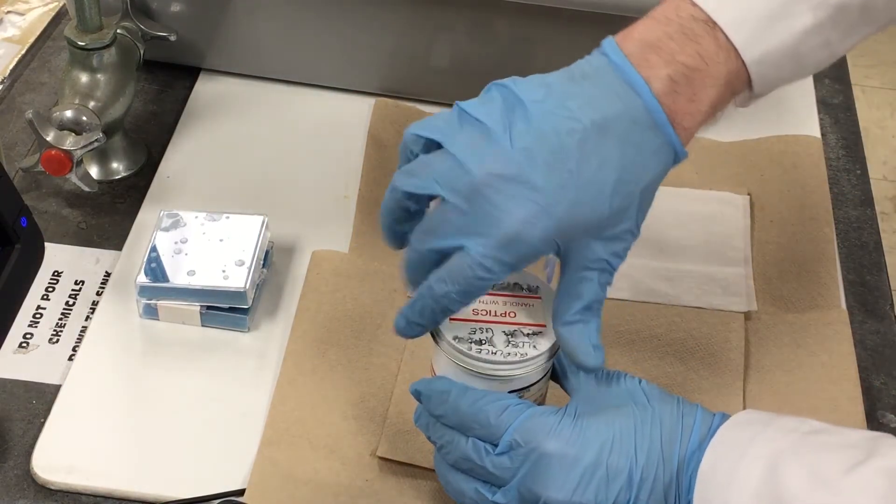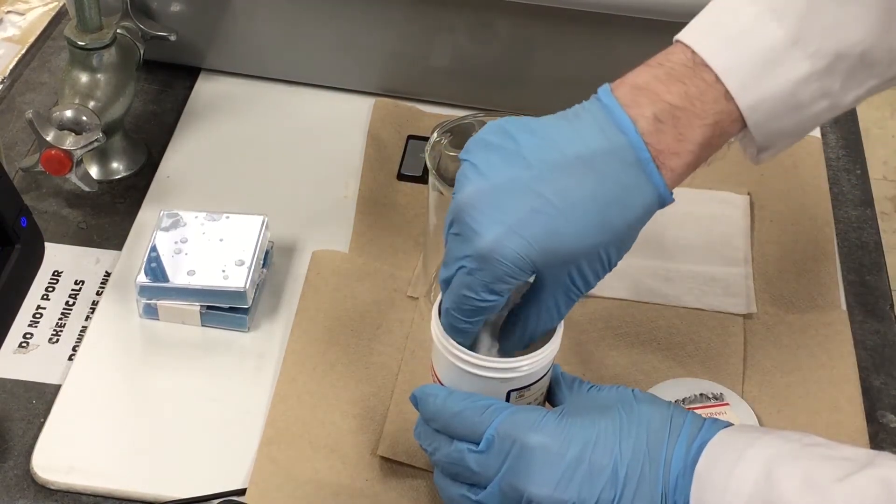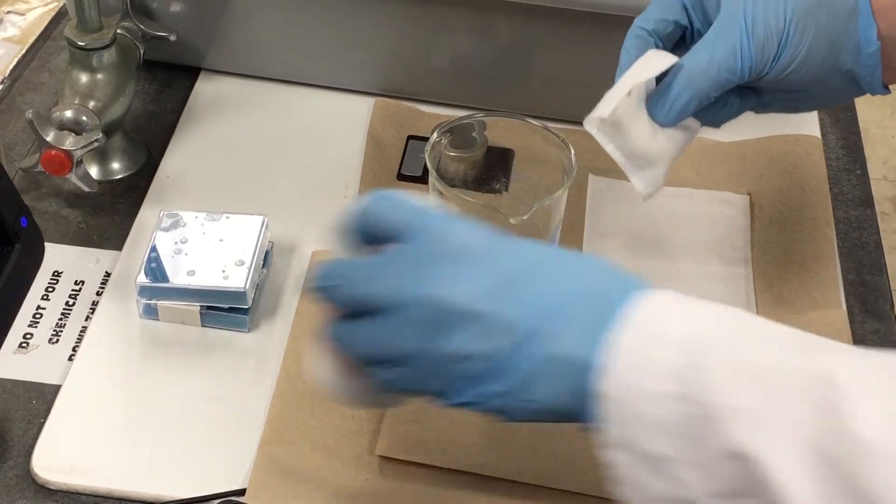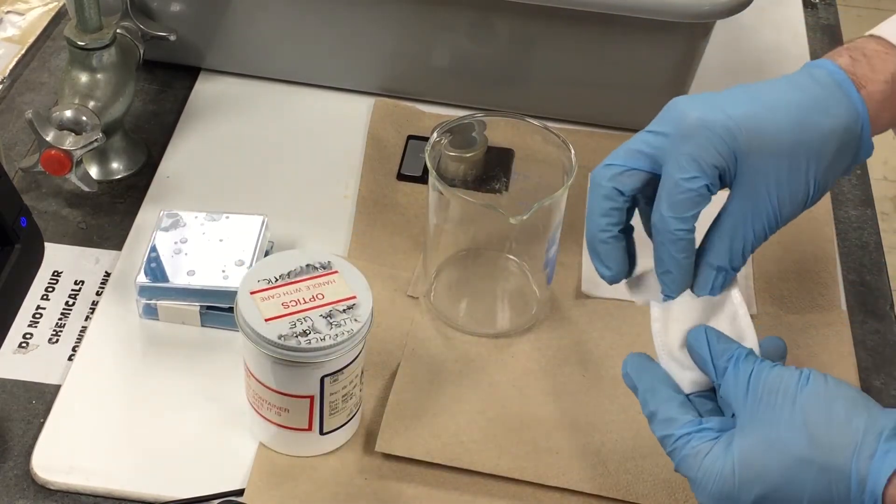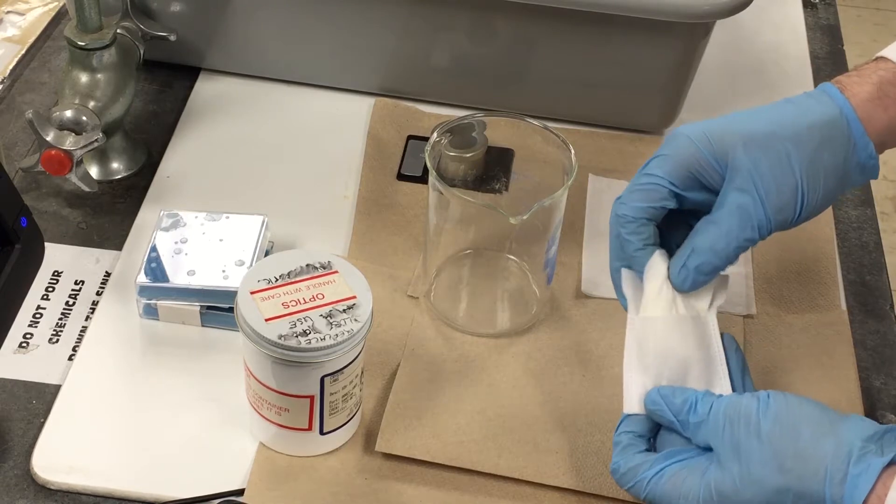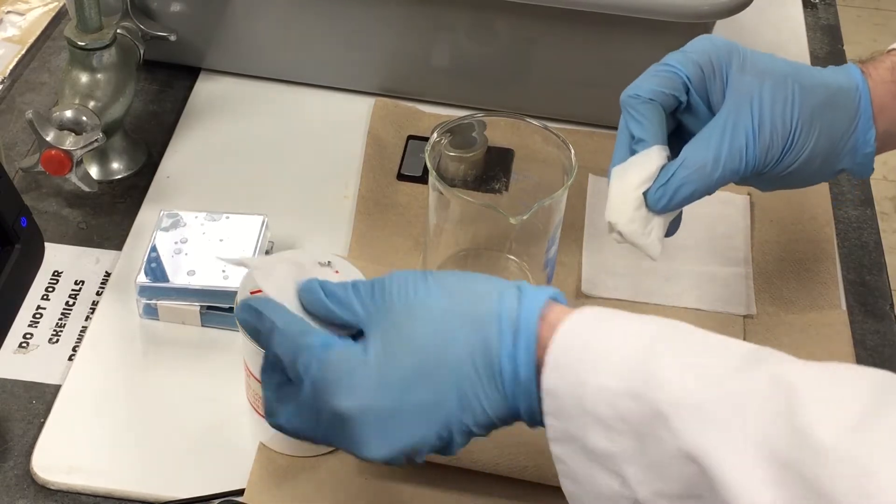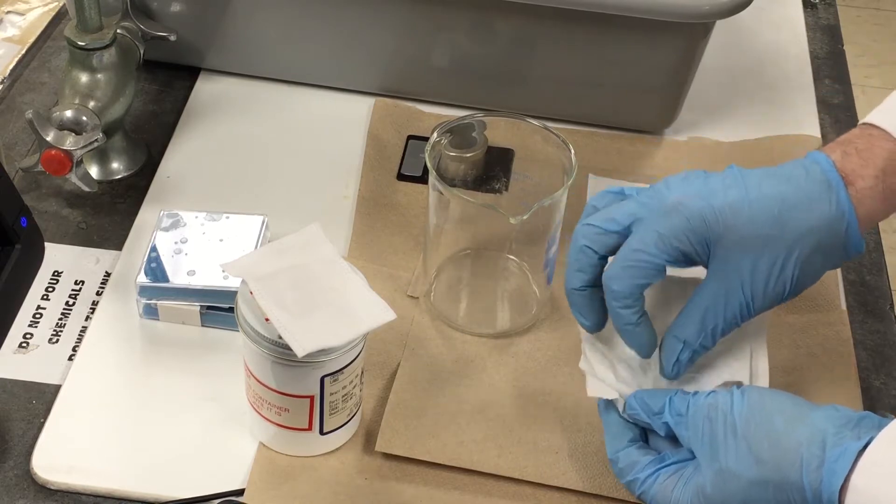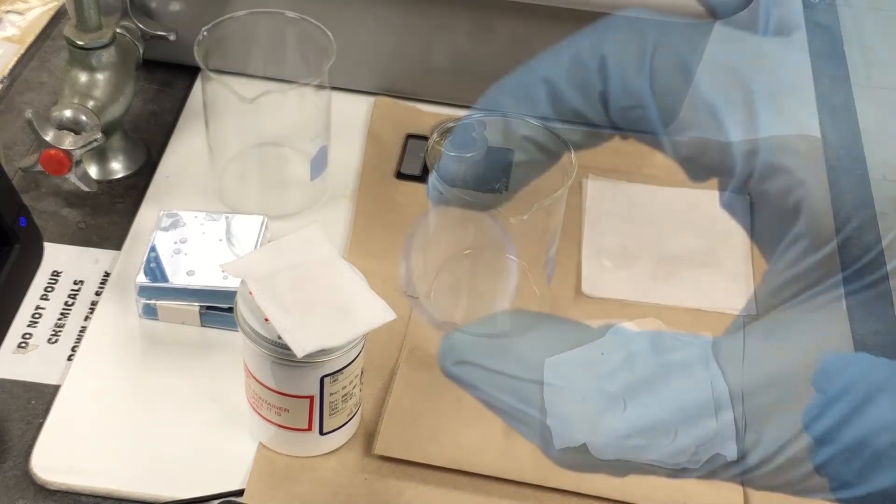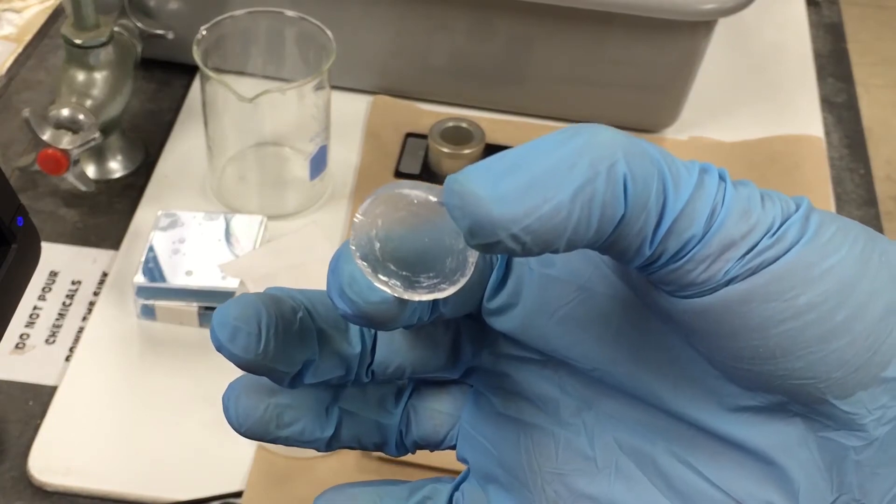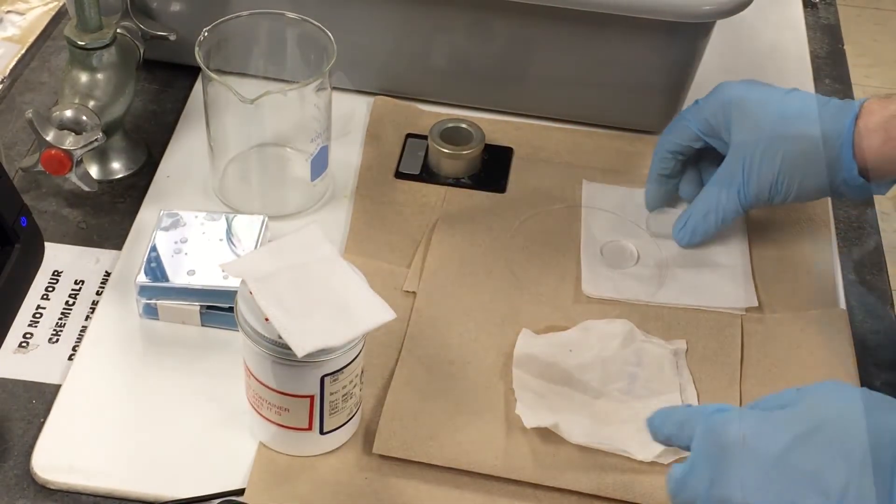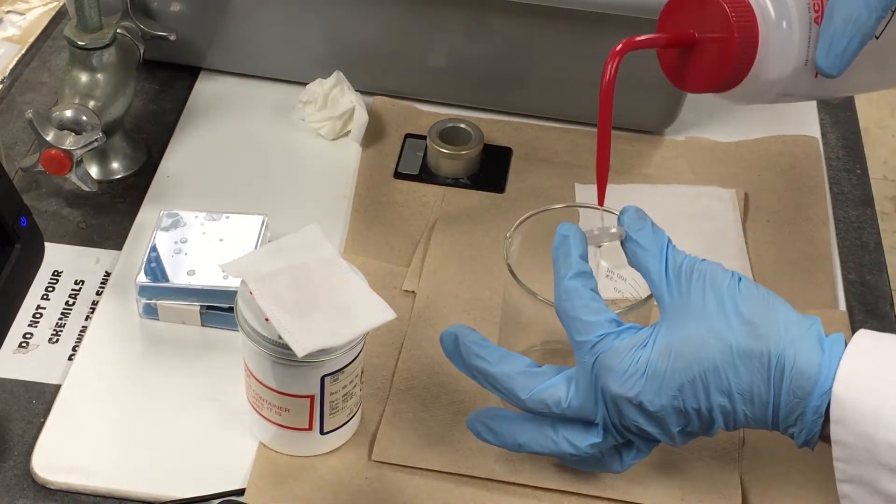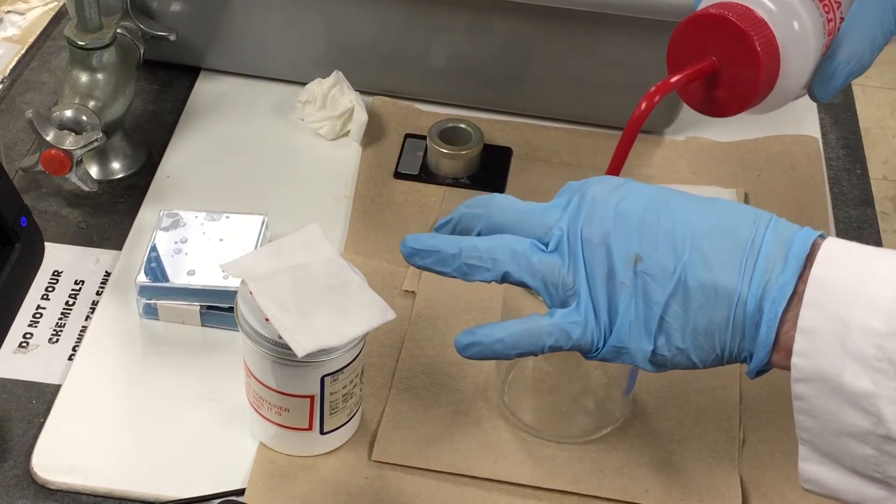Start by removing the plates carefully. Try to handle them by their edges. Rinse both sides of each cell with acetone and let dry.